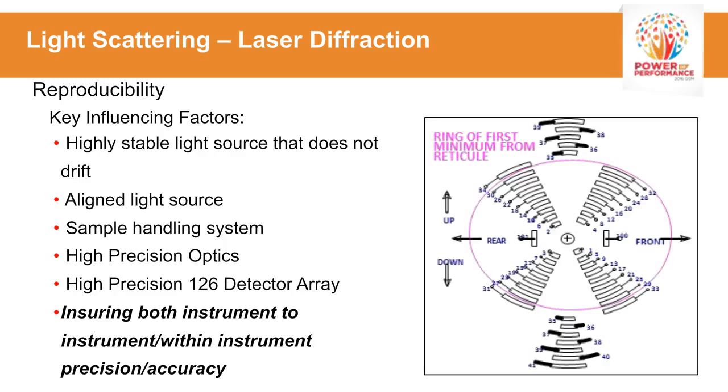And as I said earlier too, you might have angles as low as or under 0.02 degrees and out to as far as 145. But when you're dealing with particles of, say, 50 microns and above, these low-angle detectors are extremely important, and the ability to align that laser is very important.